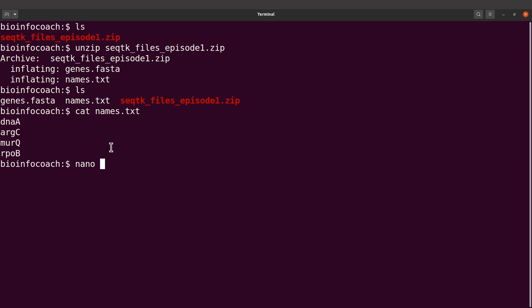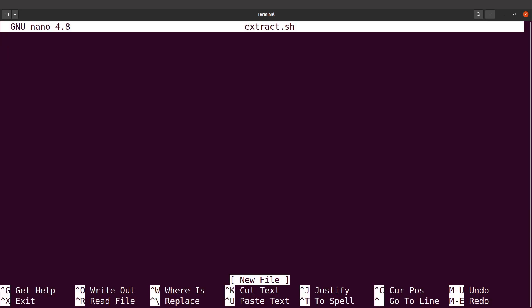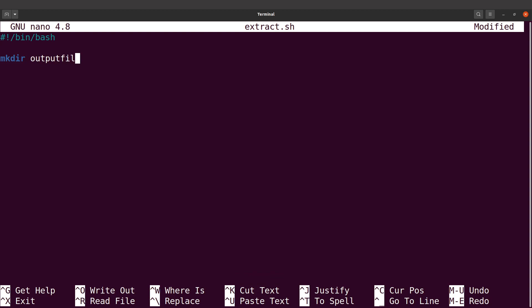Let's use a text editor. I'll use nano, but you can also use any text editor. I'll say nano extract.sh. I'll indicate my shebang line and then move to the next line. In the next line, I will first create an output directory — I'll say mkdir output_files. Then I'll move to the next line where I write the loop.